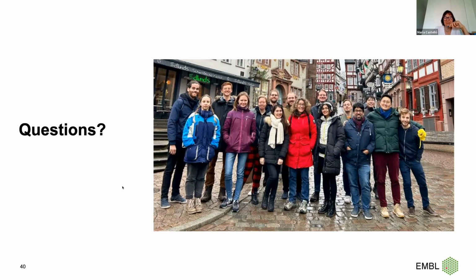Sure. Maria, I'm not an expert in all these particular tasks, but what I can tell you is that you can put in as many channels as you want in Ilastik. The only thing is, Ilastik is not particularly great at displaying multiple channels. It will give you colors for the first 3, but if you add more than 3 channels, it will show you grayscale images of the individual channels.